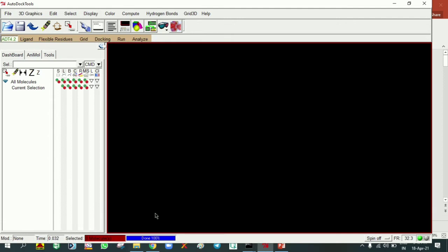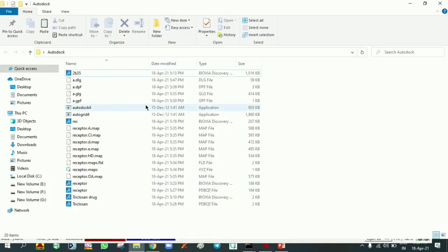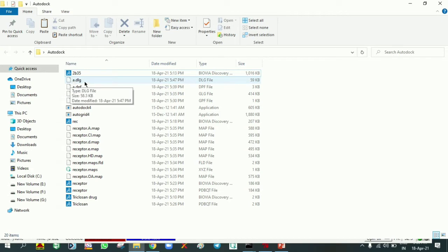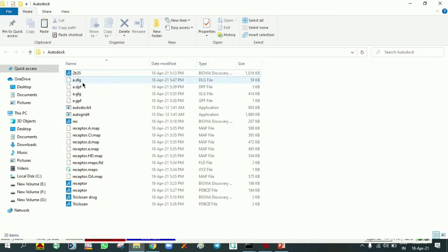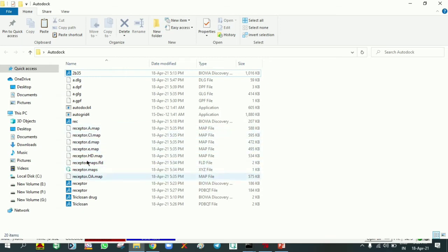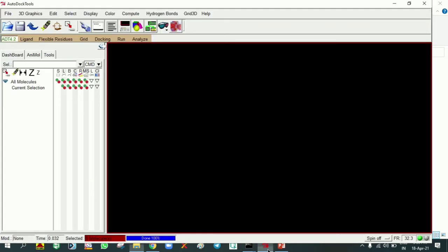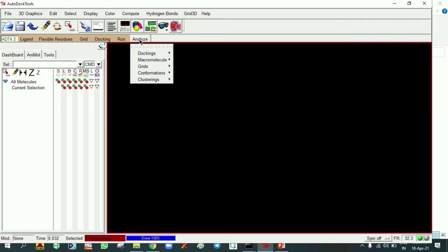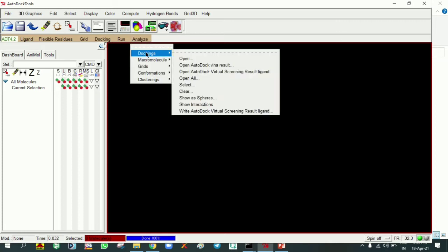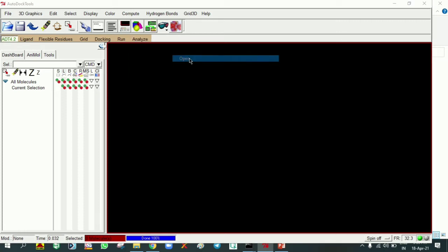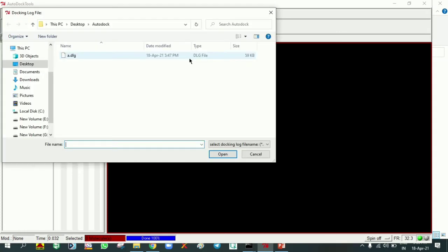This log file is created in the folder. You can see in the folder what we created: the DLG file, a DLG log file, and also GLG file, the grid log file. Both are created along with some receptor map files in the folder. Now go to AutoDock Tools, Analyze, Docking, Open. Here we need to select that DLG file, the docking log file.